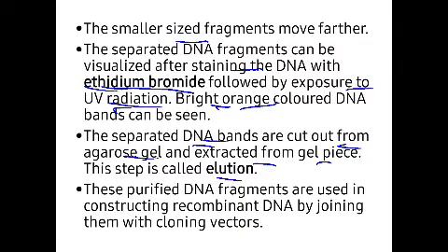Elution is a step in which this DNA will be separated after cutting out from the agarose gel, and that will be used for further research.